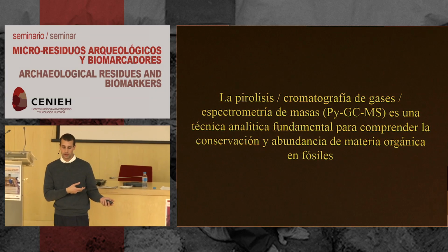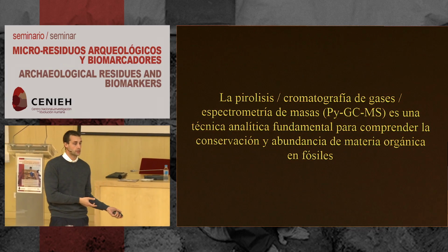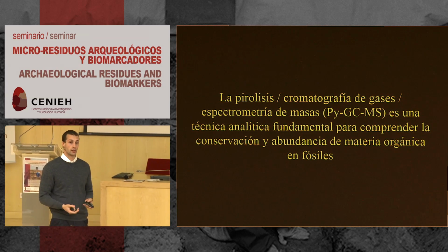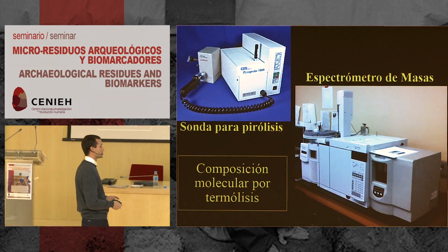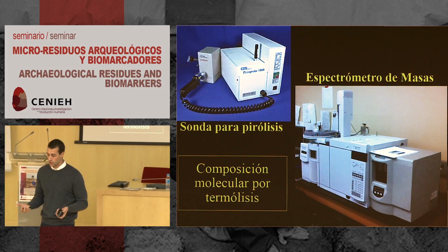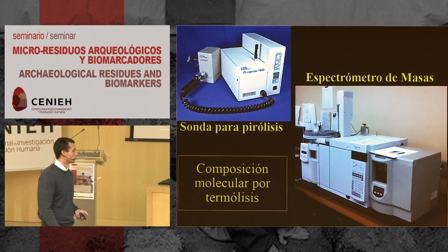So those examples that we looked at earlier from 400 million years ago, a lot of the work they did was pyrolysis. It's a really simple technique, very little sample preparation, and it gives you a ton of information with your samples.